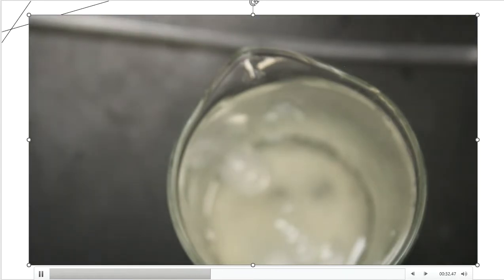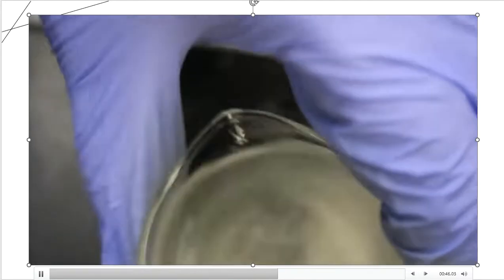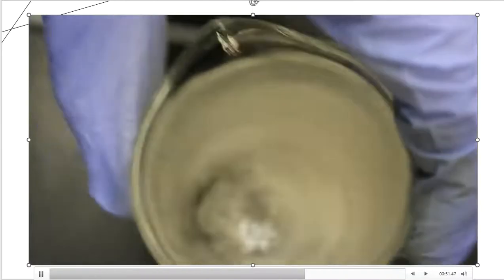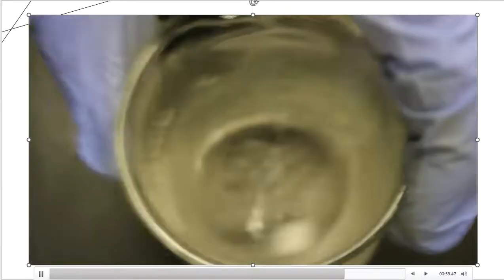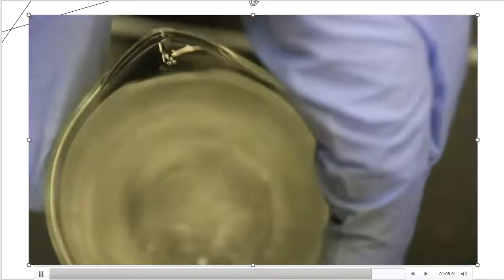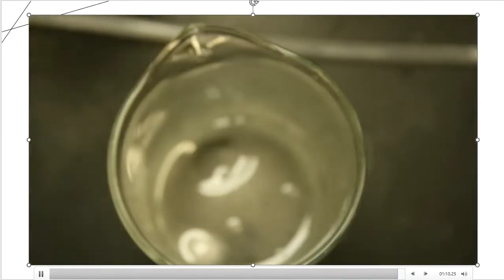So now the lab direction is going to say, once you've poured it into the ice bath, rinse out any residue, which we did, and then it says remove the aqueous layer in a separatory funnel. So now I'm going to have to take this ice water over to a separatory funnel and pour it all in, and then two layers are probably going to be present, and I need to drain off the water layer. I only want the organic layer because I'm after an organic product, and it would not be in an aqueous layer. It's in the organic layer, which is the methylene chloride that's still here. So all of this is going to get transferred to a separatory funnel, and that's our next step.